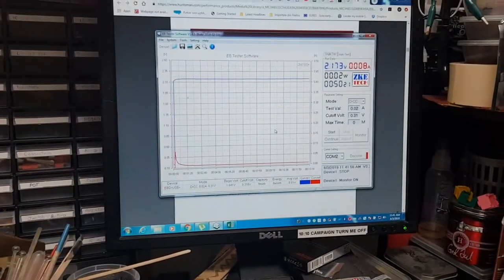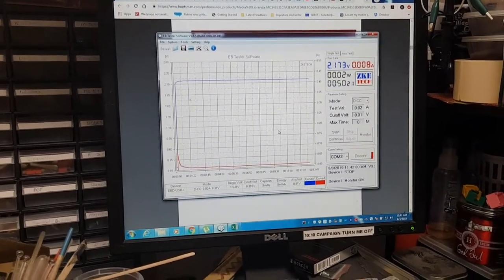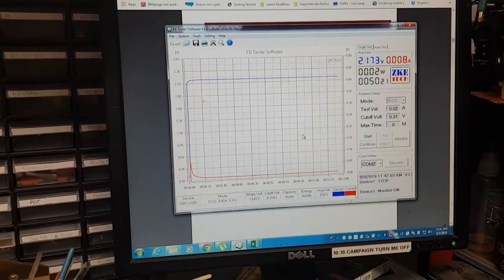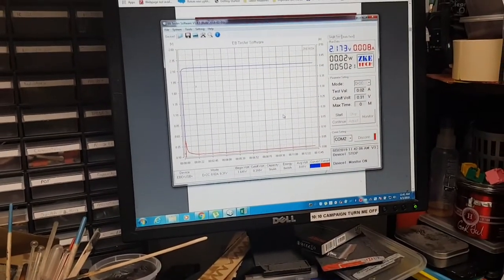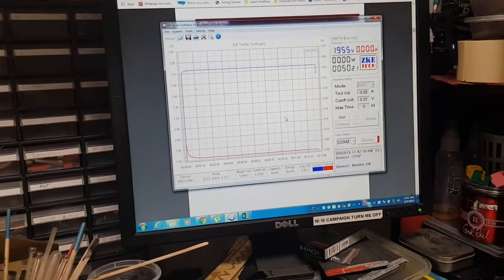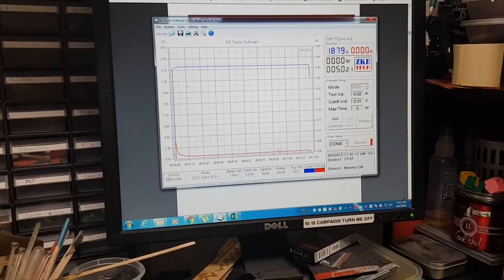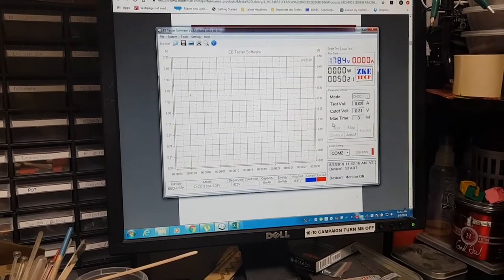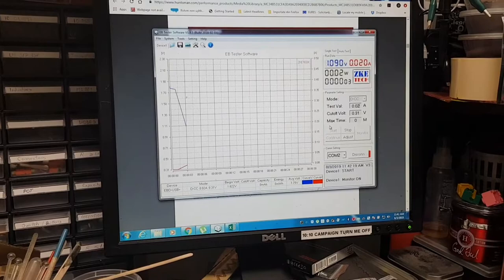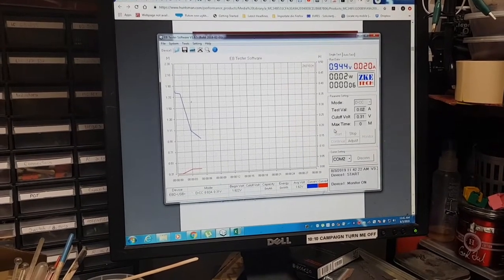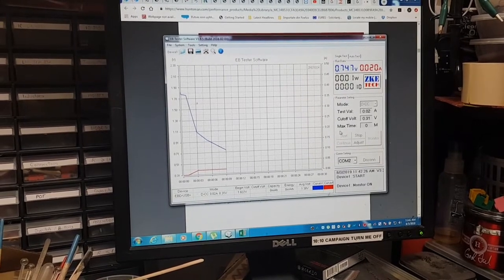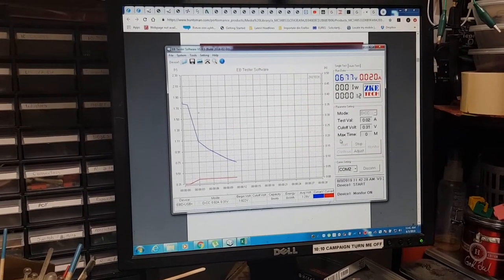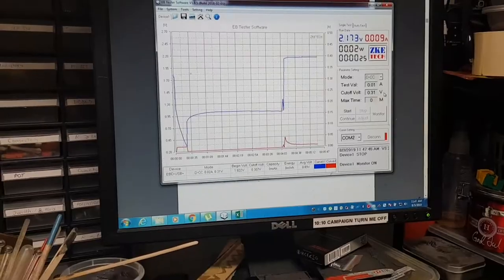We are very close to 13 minutes. I'm going to stop charging the cell now. I forgot to change to 0.010. Not very happy, I'll give it another chance to charge.